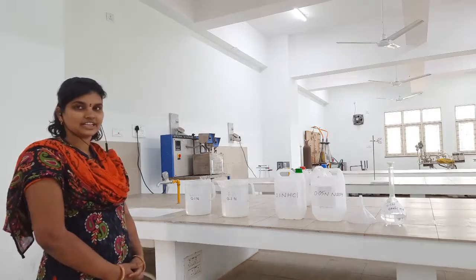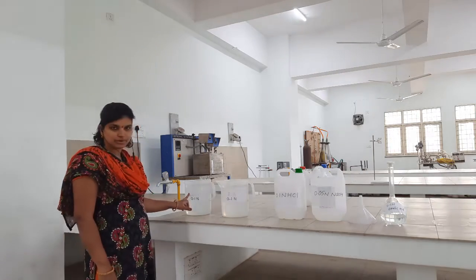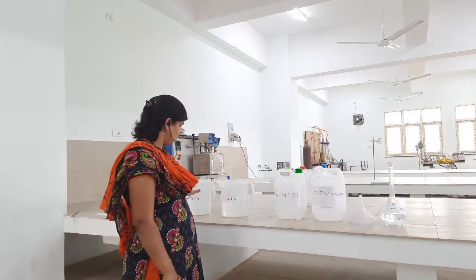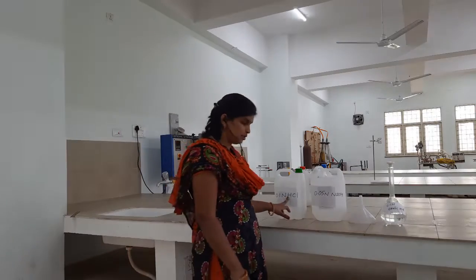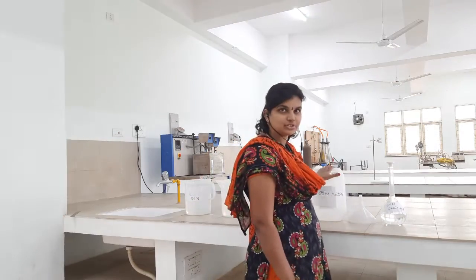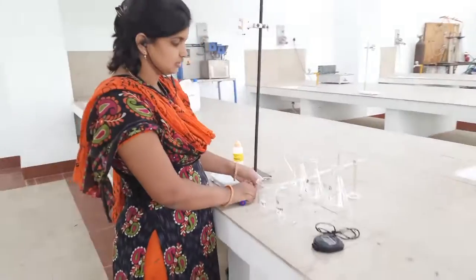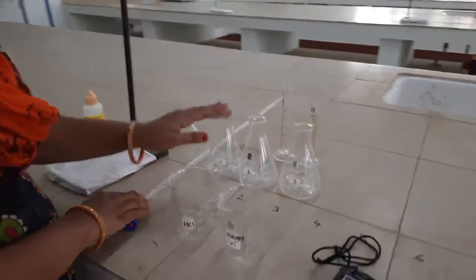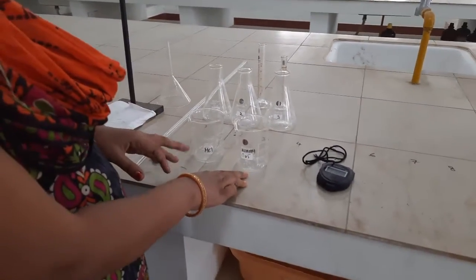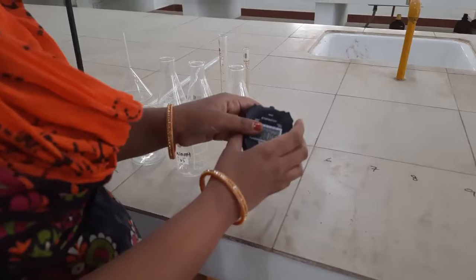Required chemicals for cascade CSTR: 0.1 normal sodium hydroxide and 0.1 normal ethyl acetate, 20 liters, and 0.1 normal HCl and 0.05 normal NaOH. We have to standardize it with oxalic acid. Glassware required: burette, funnel, 3 conical flasks, measuring jars, and one beaker each for HCl and 0.05 normal NaOH. Phenolphthalein indicator and stopwatch.